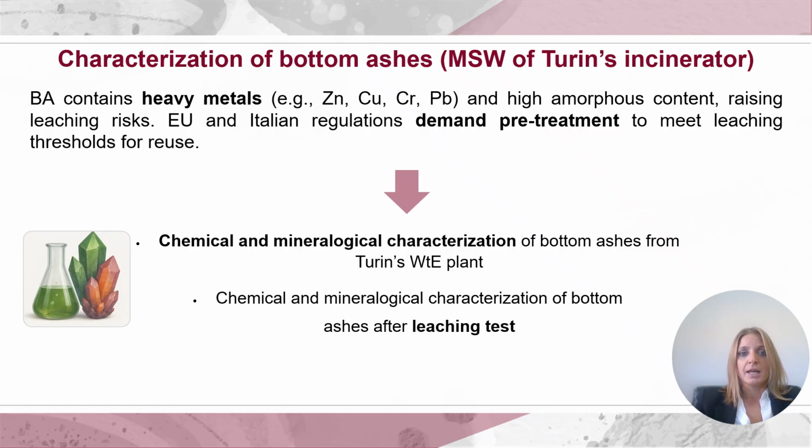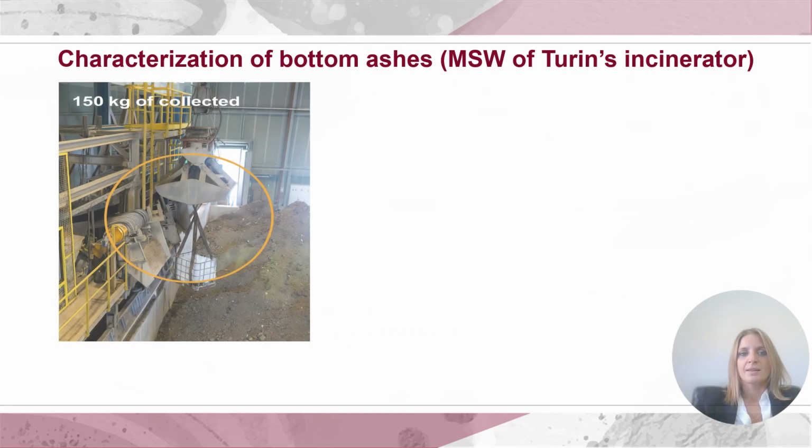Our work focuses on the mineralogical characterization of the bottom ashes as a function of particle size, combining X-ray powder diffraction and chemical analysis. This helps link composition, grain size, and leaching behavior, which is essential knowledge to design safe, efficient inertization treatments.